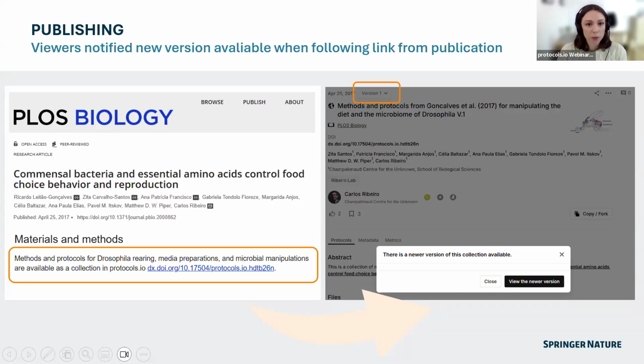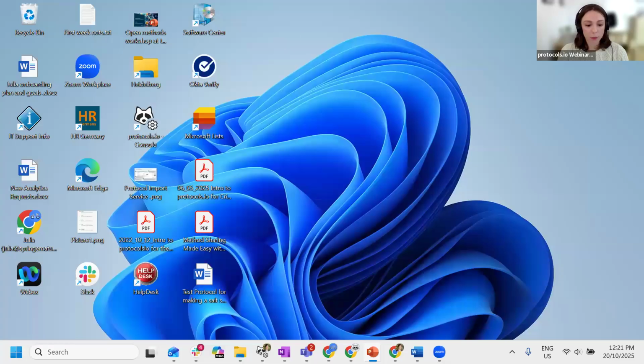I normally have a slide that shows what that looks like in more detail. I will try and show that now, because I think it's a really nice one that I have missing here.